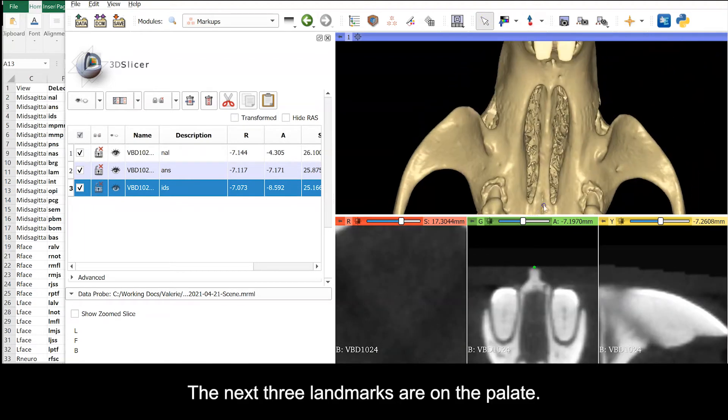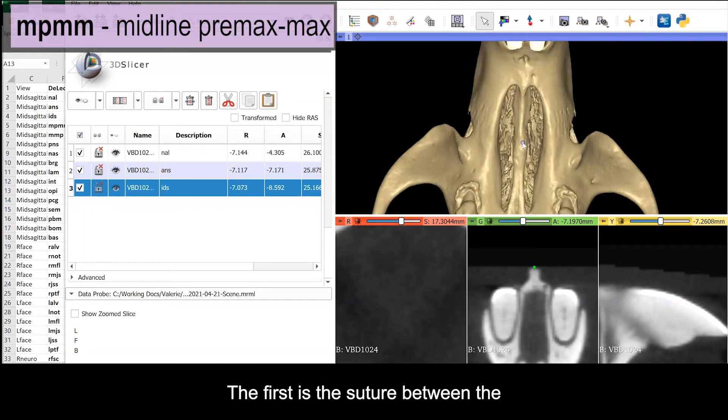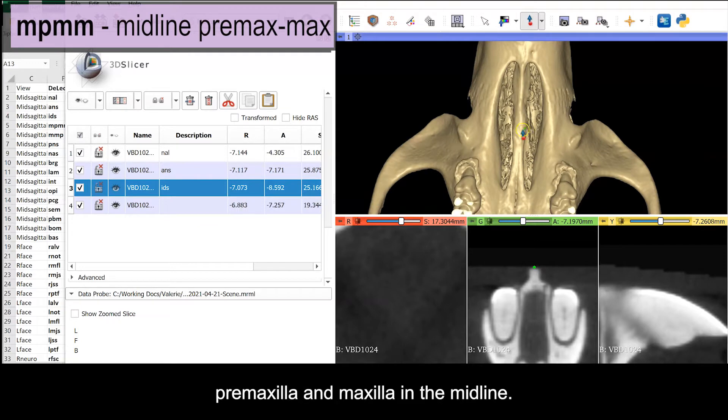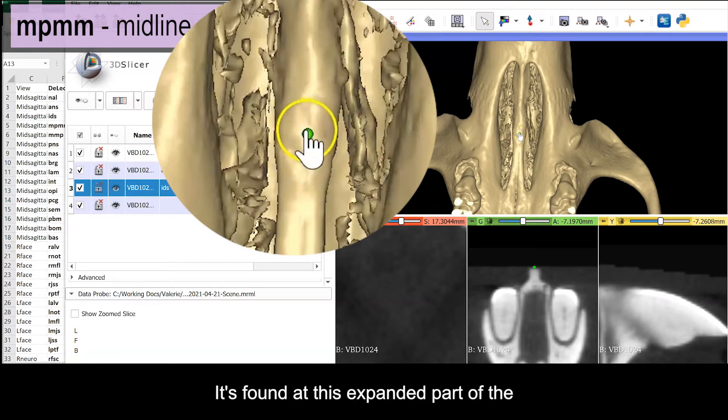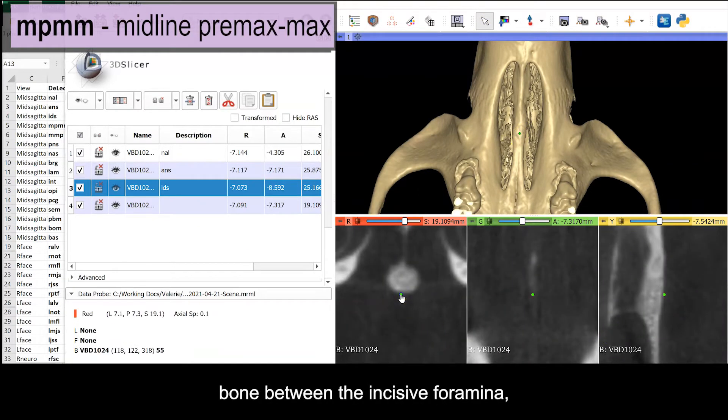The next three landmarks are on the palate. The first is the suture between the premaxilla and the maxilla. In the midline, it's found at this expanded part of the bone between the incisive foramina, which are huge in the mouse.